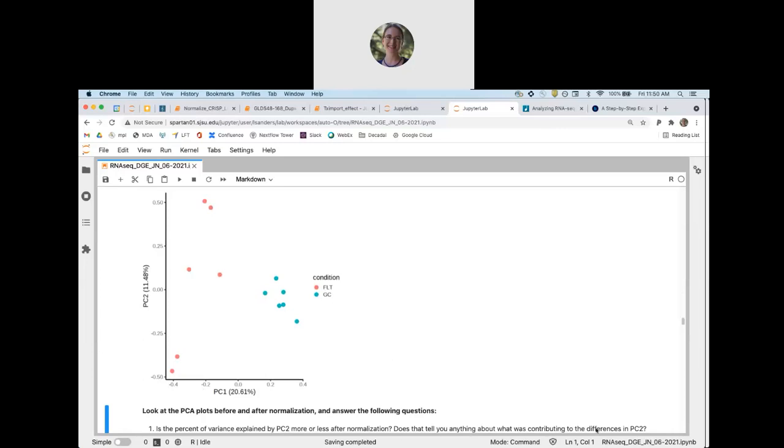So what does that tell you about what was contributing to the differences or the variance within PC2? Excellent, you guys, exactly, read depth.